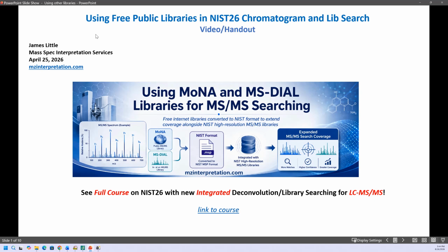This video and associated handout discusses using free public libraries and NIST26 chromatogram and libsearch functions within the NIST search software. It's part of a full course on NIST26, which includes the newly integrated deconvolution library searching for LC-MS-MS, and here is the link to the course.